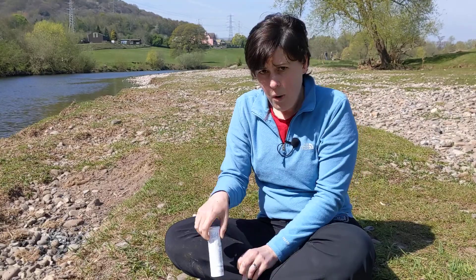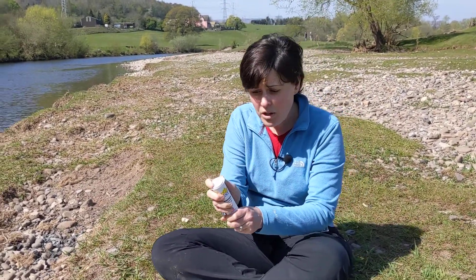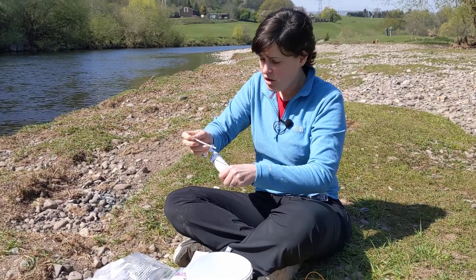Pop the cap on while you get the test strip out. Try and keep your fingers dry when you're going into the tube and just shake one strip out, trying to keep the rest clean and dry. Cap back on straight away.